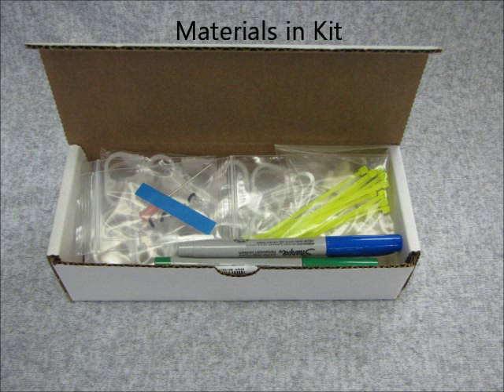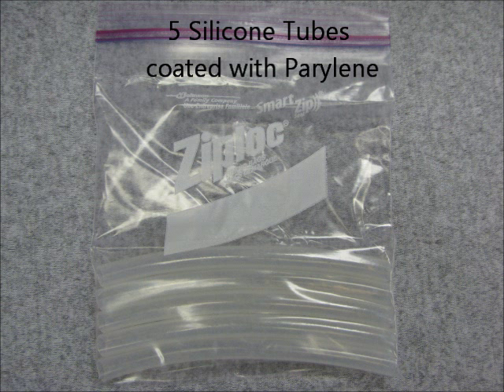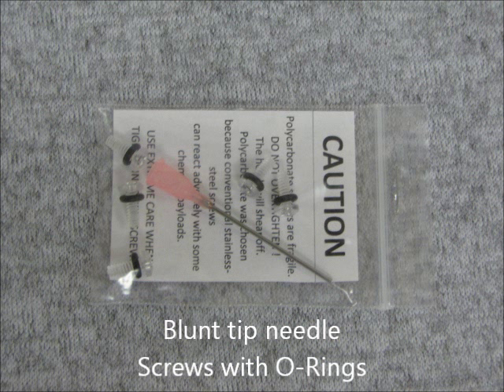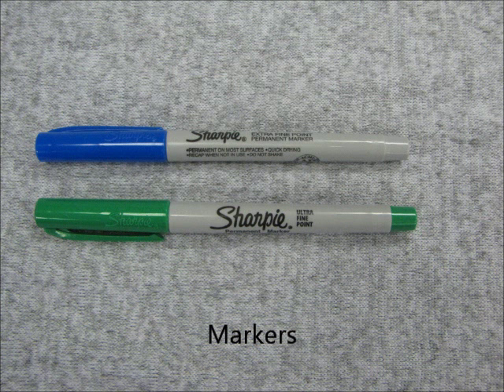The materials for making your mixture tube come boxed in the kit as shown. The kit includes 5 silicone tubes which are coated with perylene, a total of 10 plastic end caps, 5 of which are solid, 5 of which are bored with screw holes, and a blunt tip needle that is bagged with 5 screws with O-rings.